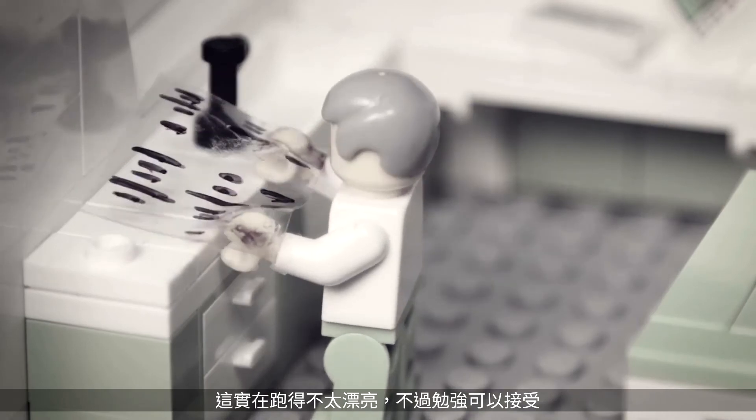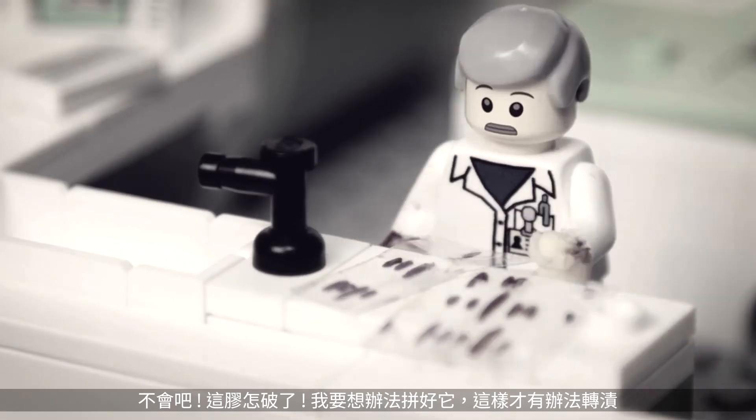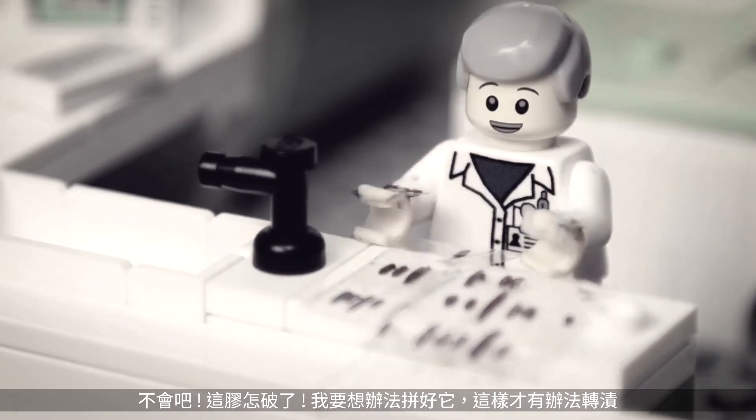Bands are a little streaky, but it'll do. The gel is tearing — got to try to put it back together for the transfer.